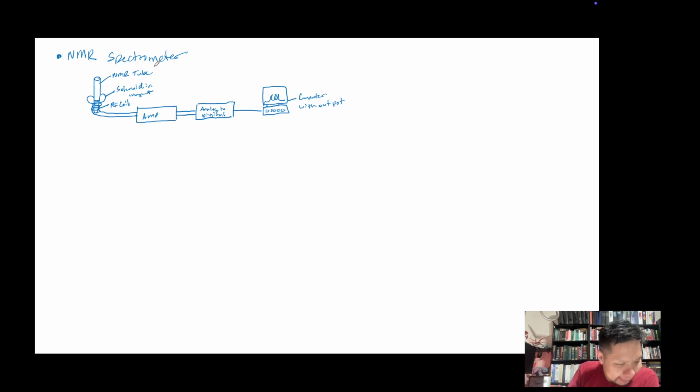Anyway, it's important to know that if we imagine that the NMR spectrometer has a coordinate system in it, where we have the z-axis, the x-axis, and then the y-axis over here, right? The magnetic field, also known as B naught, is in the z direction, right? Direction of magnetic field, right? And that's along the z-axis. That's along the z-axis, okay?